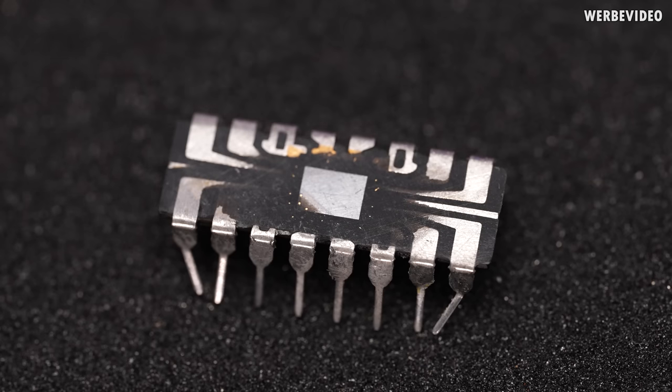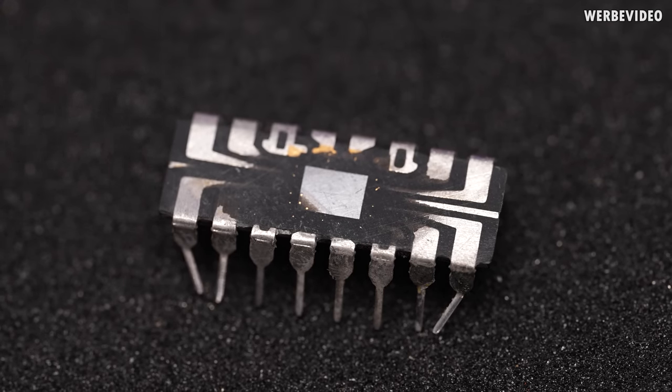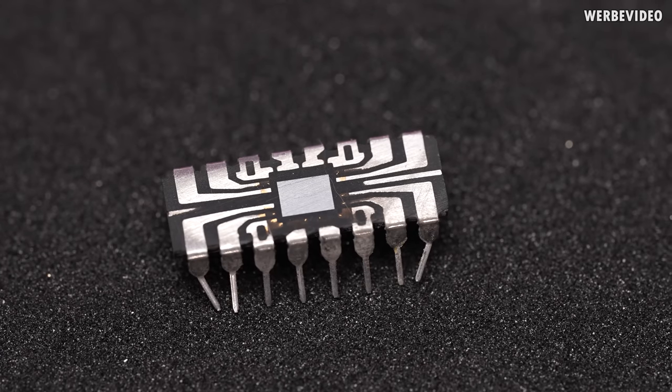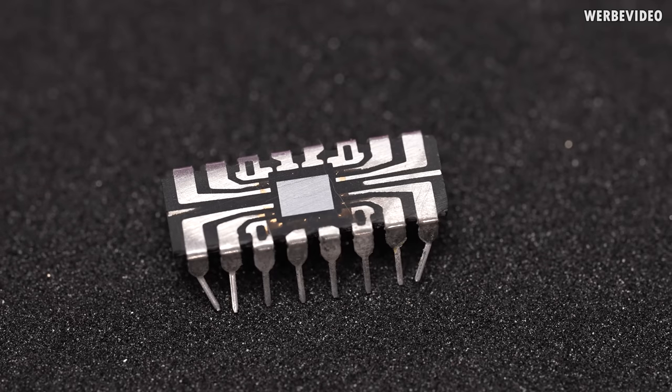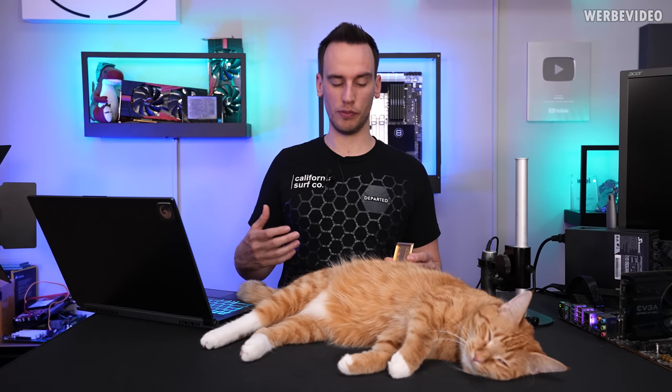My original plan was to decap one of the 4004 CPUs, remove the die from the center, send it to TESCAN to get some transistor analysis, SEM pictures and all this stuff, but then it turns out it's not that easy to decap one of these chips, at least not for me.